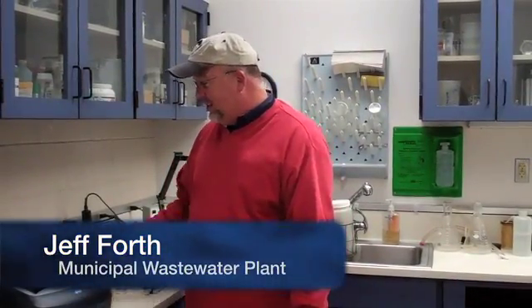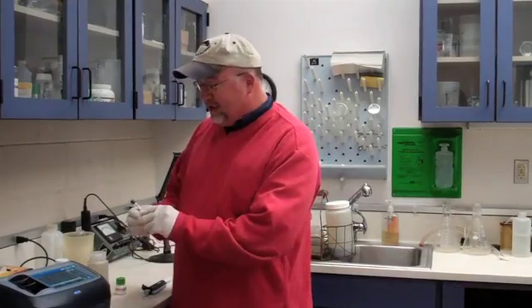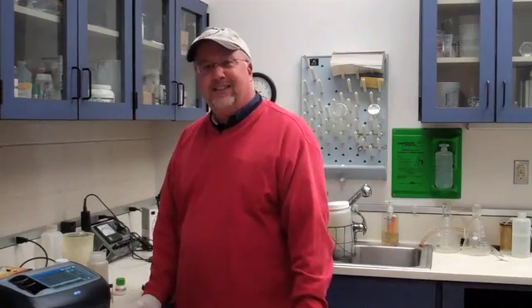My name is Jeff, and I'm here to show you how we're going to test today for nitrate in our final effluent. At our activated sludge plant, we're going to use this TNT Plus vial for that test, and just run through it and show you how easy it is to do.